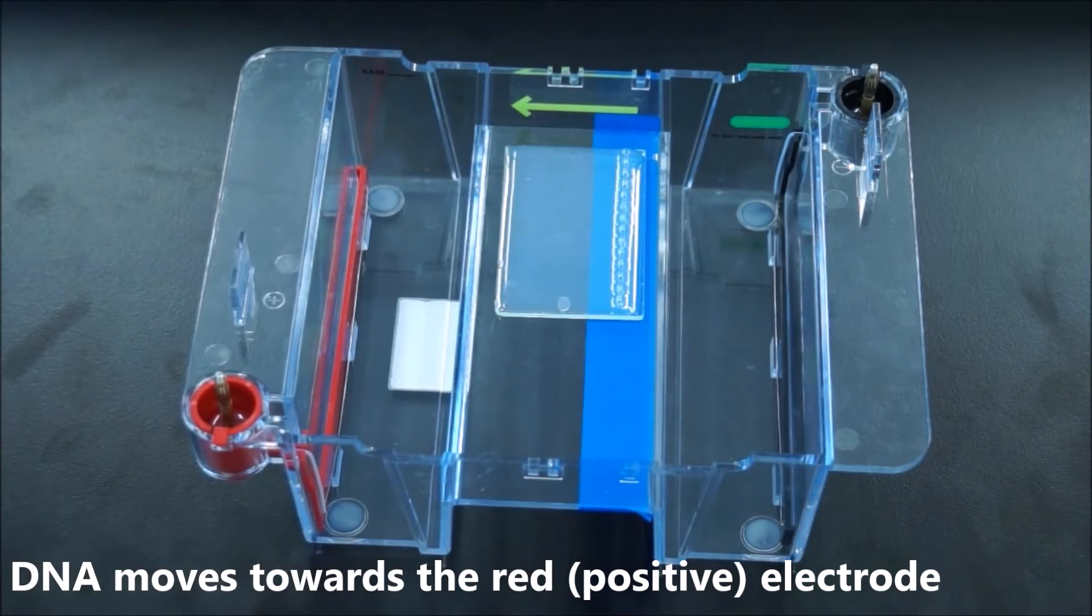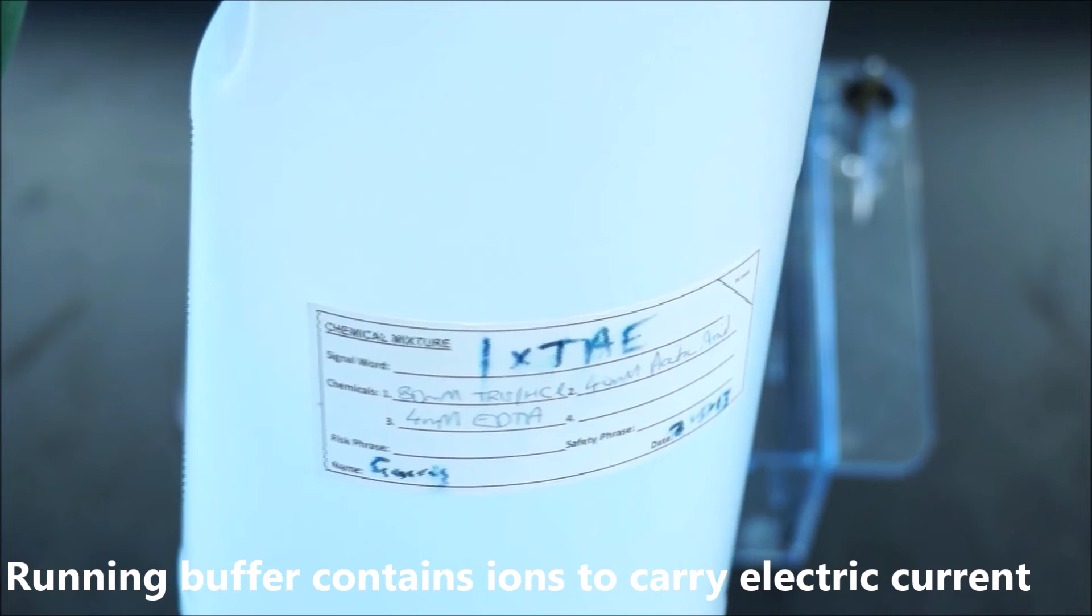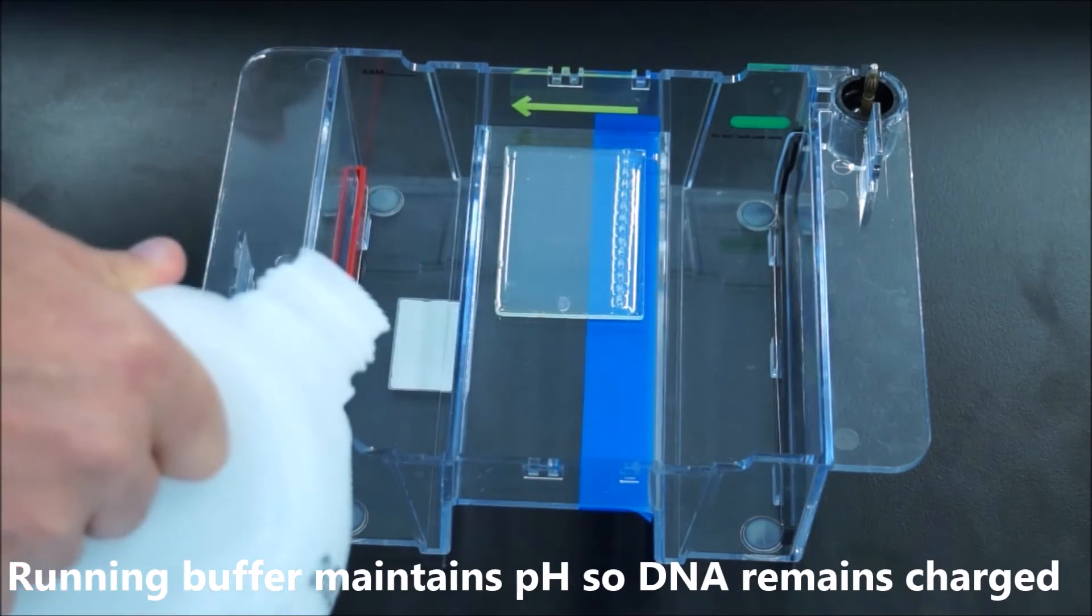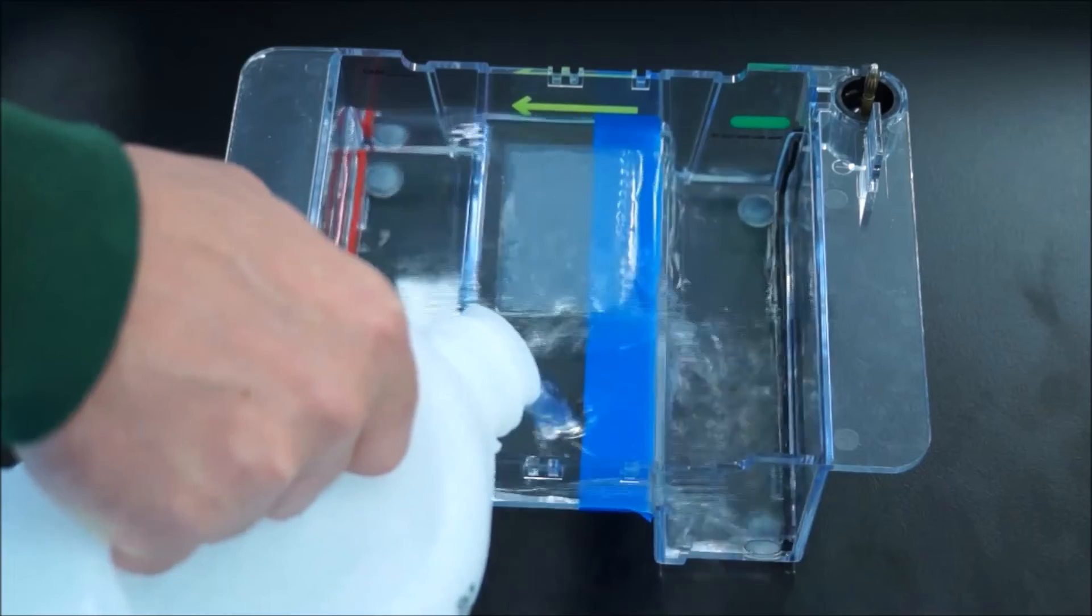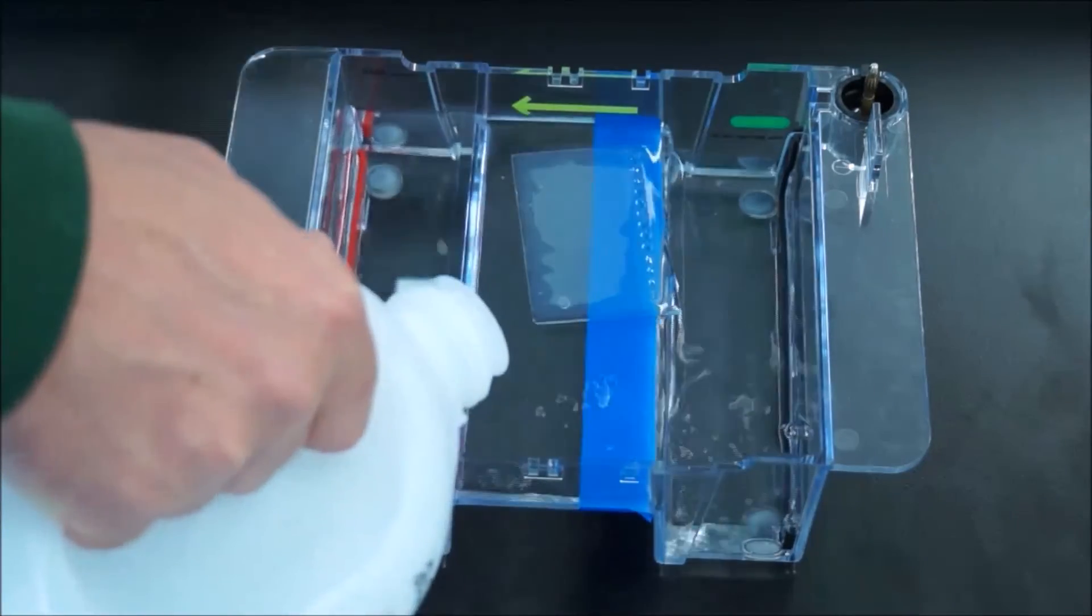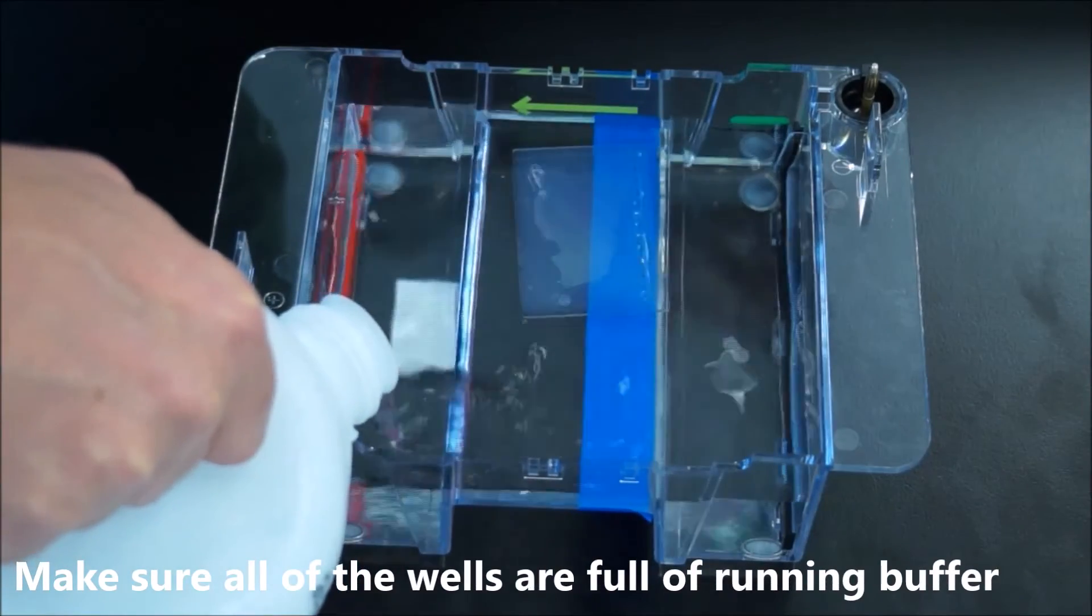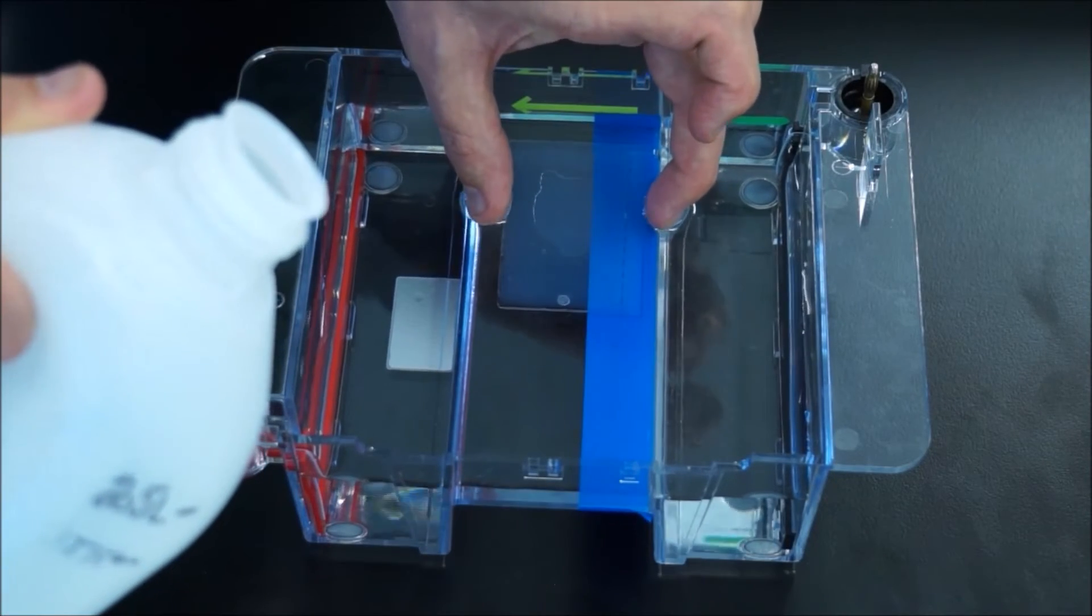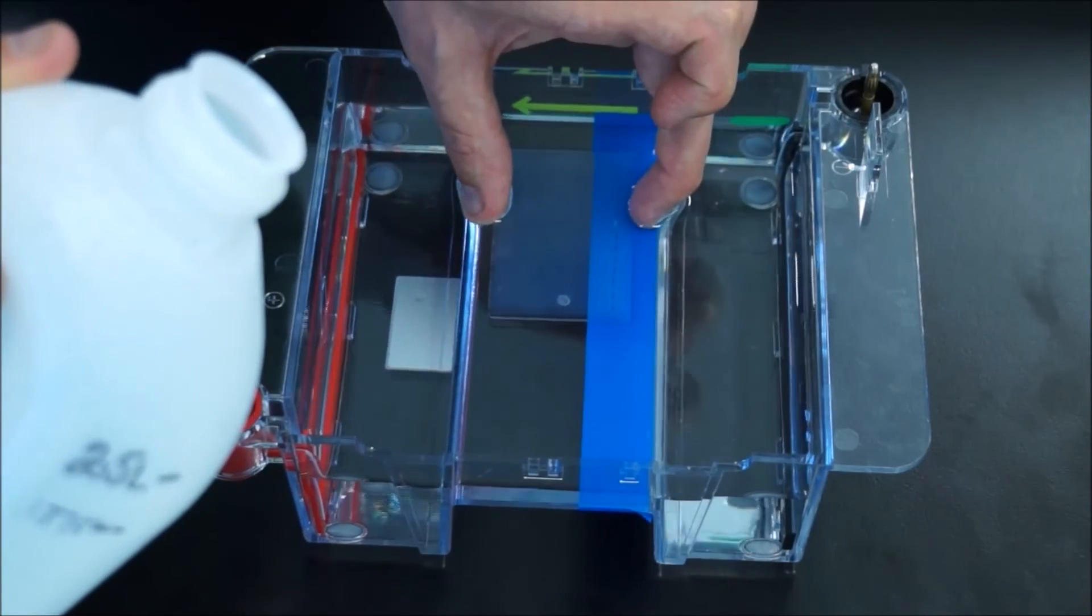Next you should find some TAE. This is also known as running buffer and it's full of ions so the electric current can pass, and it's the right pH. Just pour that in. You want just enough so it just covers over the top of the gel. Once all the wells are filled in, that's fine. You might find that your gel moves around a little bit - that's alright, you can reposition it at any stage.